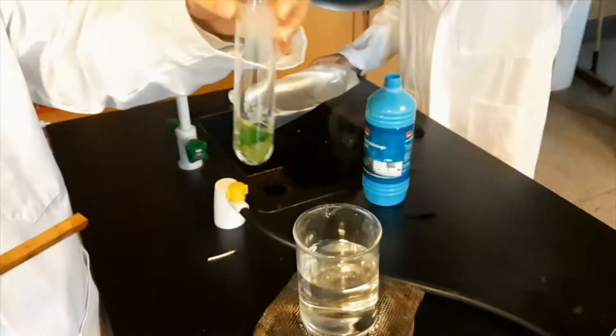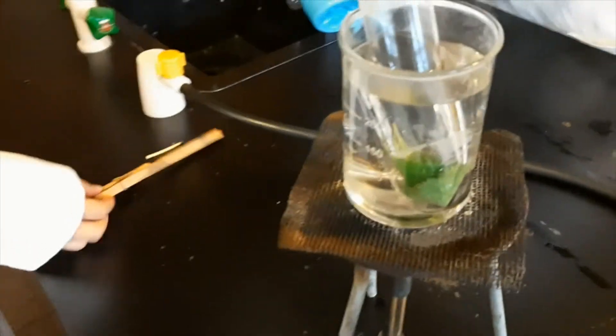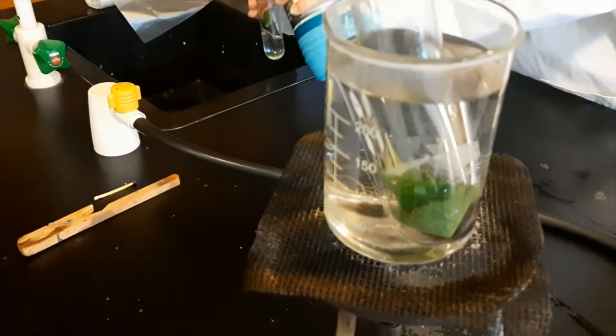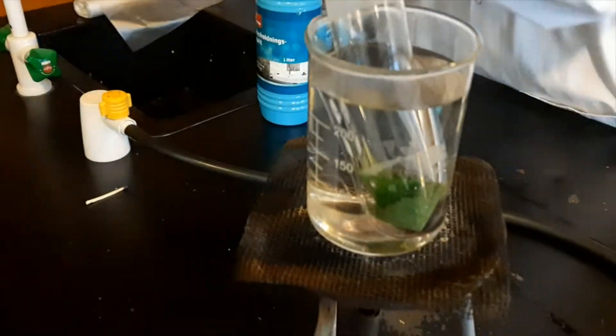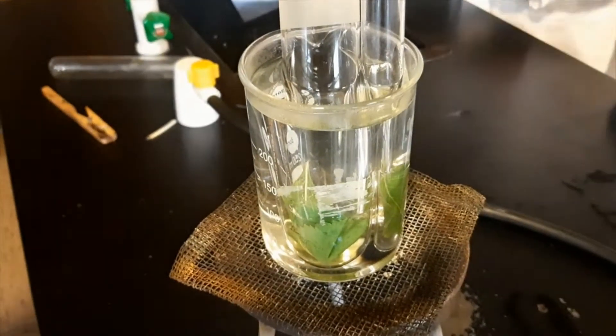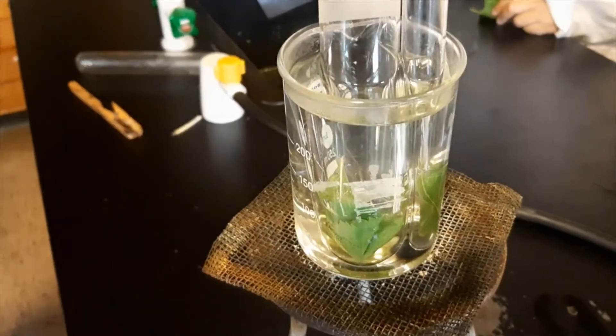You then take the leaf and place it here. Since the alcohol has a lower boiling point, it will soon start boiling away, hopefully removing the chlorophyll as well. Then we wait for about seven minutes as the alcohol slowly boils away.